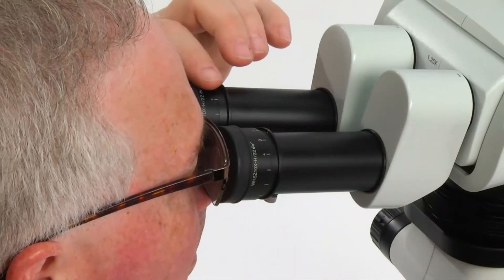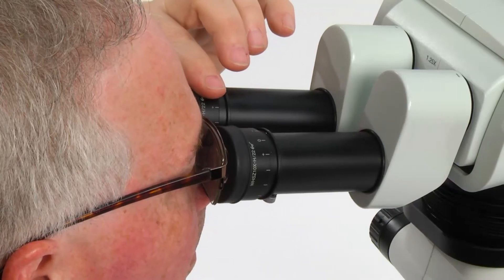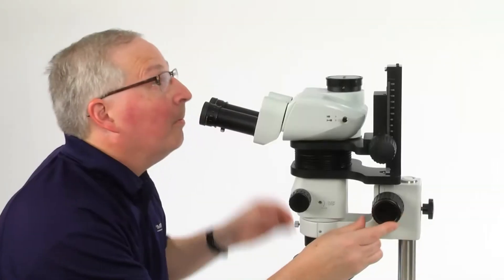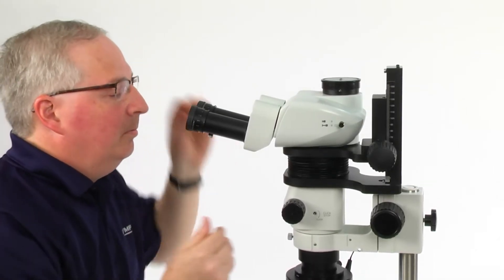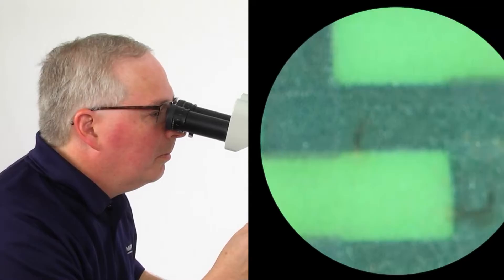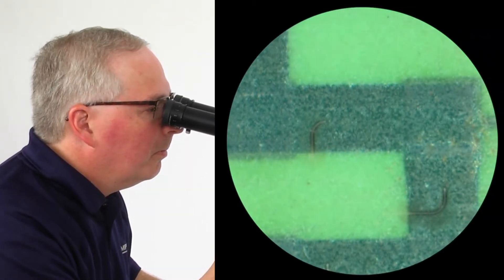The diopter adjustment is used to compensate for differences between one's eyes and is an important step in preventing eye strain that can lead to fatigue as well as eliminating the tedious task of having to refocus the microscope every time the zoom is changed.